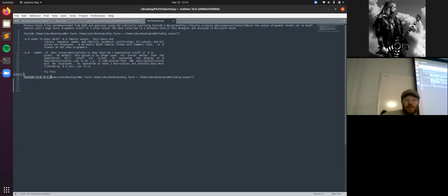And then it runs the program with this, it runs the program with this, and then it spits out an output file where you tell it where you want it to go, and then you can name it. So I could type whatever I want. Like I could type, this is an example output. And if I run it, hopefully this file should appear on my desktop.